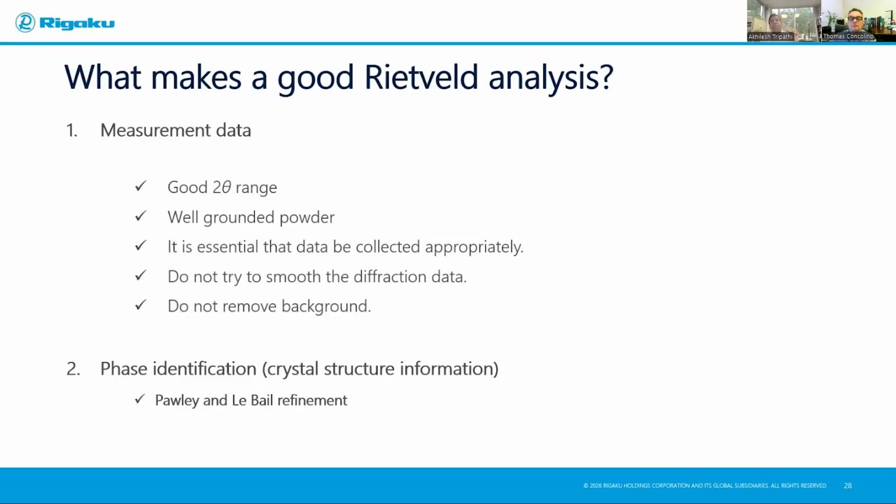Now, I'm not that pushy. I'm not saying collect every data up to 140 degrees in organic, but at least 5 to 100 or 5 to 90, I would say that's the minimum for me, a good range.